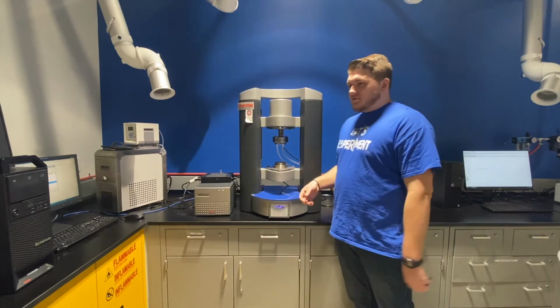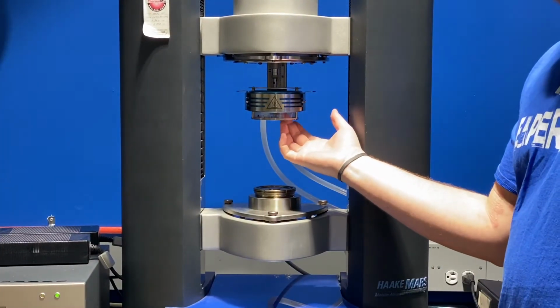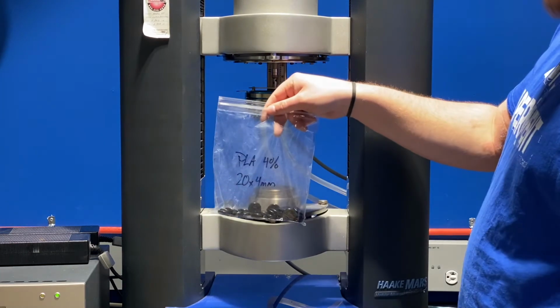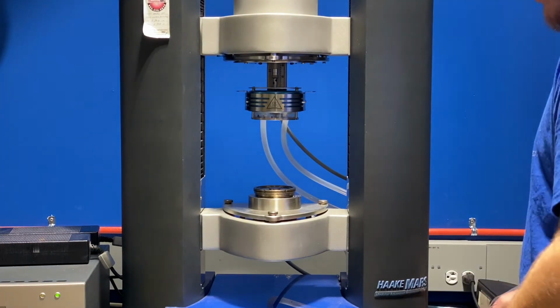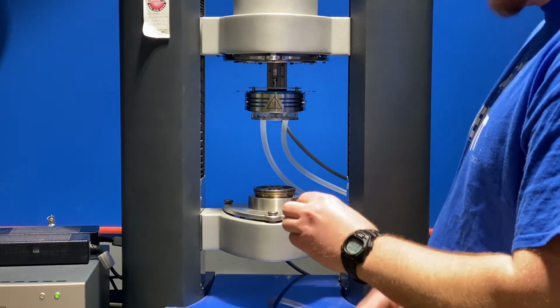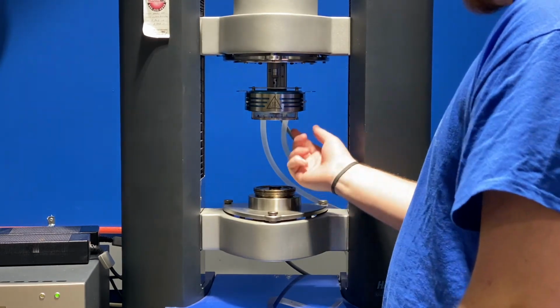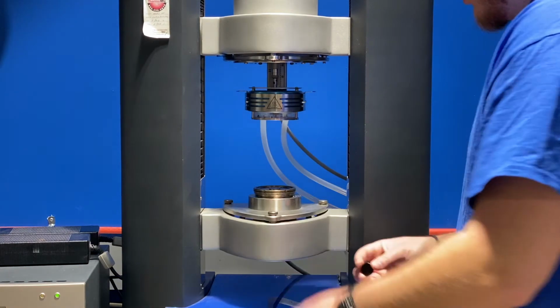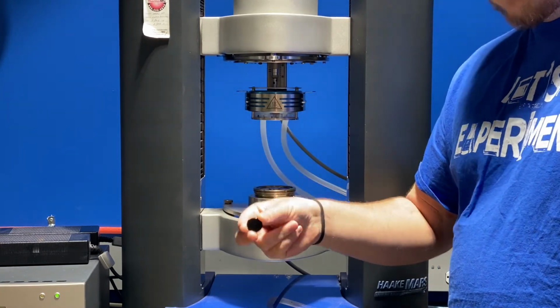Like I said, this is our rotational rheometer. Essentially how it works is we have our two plates right here, and there's another plate up in here, and in this case they're both small circular plates. And so we have our material here. In this case, we have a specialty PLA with carbon nanotube infill, according to Skip at least. So it's just these little discs, and these discs can vary in size depending on the kind of test we want to run and what kind of data we're trying to find. So essentially we just take the disc, put it on there, and lower this down, and the plate in here is about the same size as this disc. And essentially, once it applies pressure, this one will oscillate, going back and forth repeatedly over time.